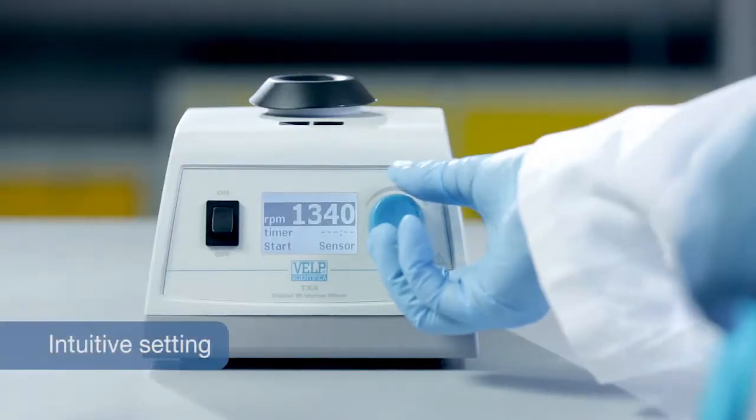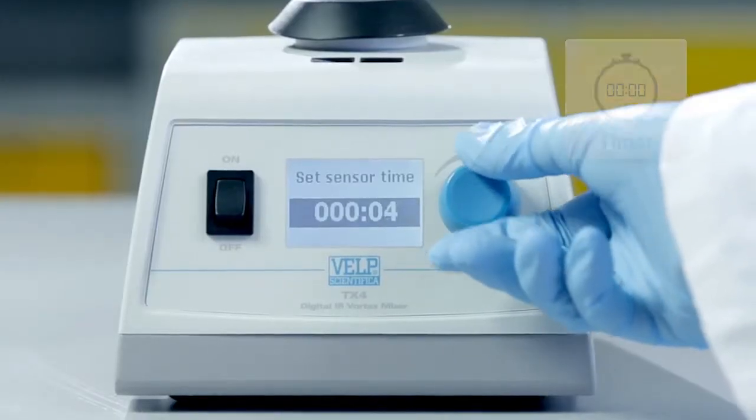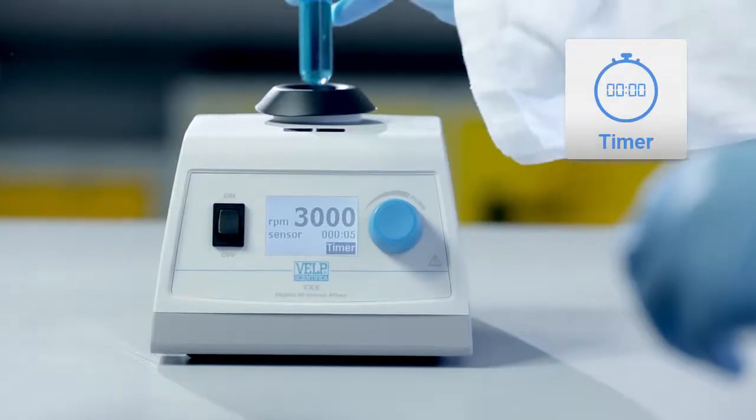The TX4 guides the user with an extremely bright and easy to read display, showing all the most important parameters and the timer.